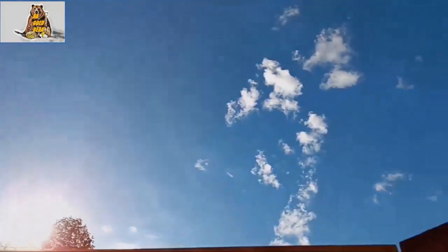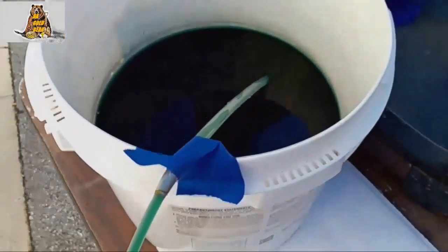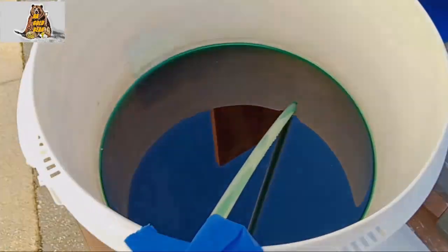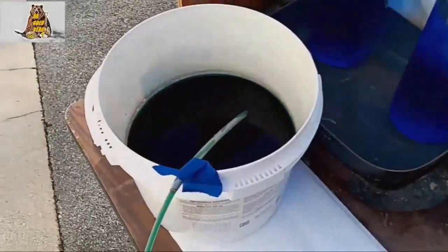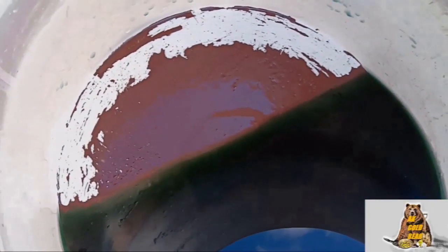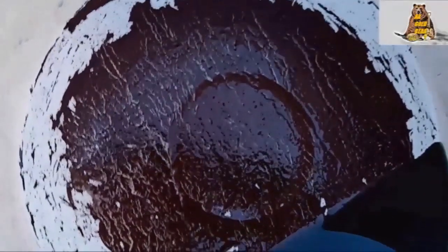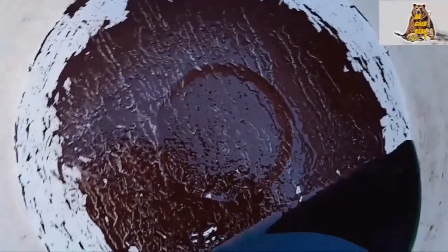Beautiful morning, sunny day. I hope I will see some gold at the bottom of this bucket. Slowly draining the dirty solution — already can see gold. Gold like a mat, like clay. Well, this is not what I would like to see, but it is what it is.